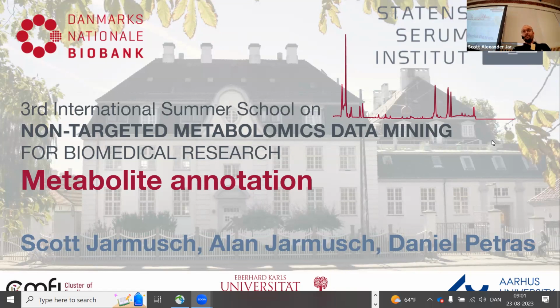It's important to know that you have good quality data. It's important to know that your pre-processing is doing a good job picking your peaks, but you ultimately want to know potentially what's in your data. That's how any of us add some context to some of the work we do. And then later this morning, we'll jump right into molecular networking. If I remember correctly from Robin's talk yesterday, less than 50% of the participants have not done molecular networking, so this is great. We'll dive into it and we'll start looking at some of the data.